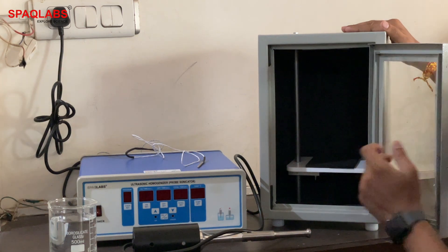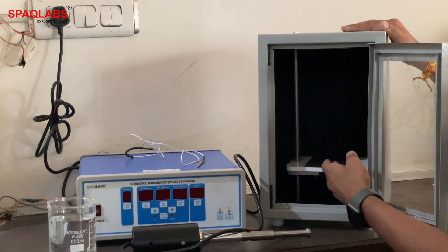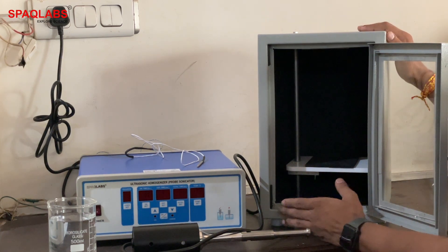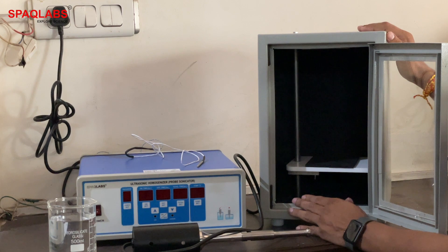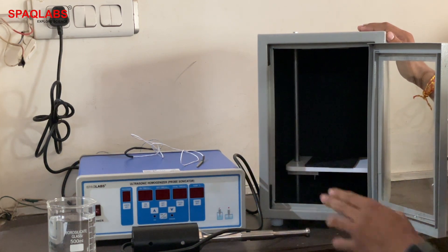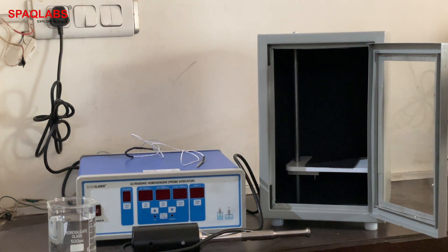We will adjust the base according to the beaker size. The beaker size range is designed for 50 ml to 1000 ml. Its power range is 750 watts. First, we will place a beaker in the probe sonicator.